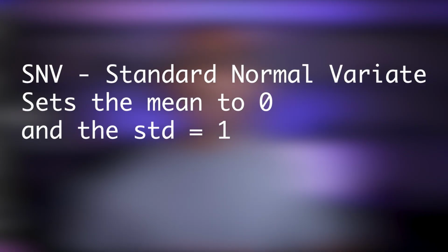But because of all of these impacts, we have to do some signal processing before we can build models. So don't click away. This is incredibly important in order to build reliable models. I'm going to use two different techniques to pre-process this data before we start building models. The first technique is standard normal variate. This technique removes scan-to-scan differences in overall brightness.